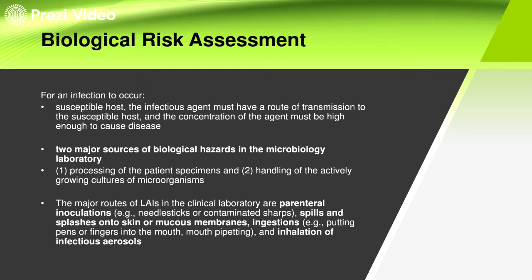Now, ano ba yung two major sources of biological hazards in the lab? Saan mo makukuha yung mga biohazard na yan? Unang-una sa specimen mismo. So, kunyari, yung sputum ng pasyente, yung urine ng pasyente, o dyan magagaling talaga yung microorganism. And then after that is the cultured microorganism or the grown culture. When you say grown culture, ibig sabihin yan, pinrocess mo na, nagprocess ka na ng specimen, pinatubo mo na siya sa culture media, kaya yung mga bacteria tumubo na.